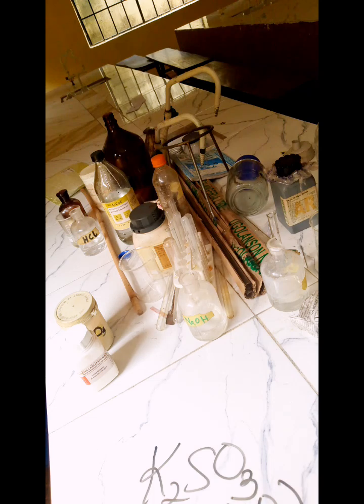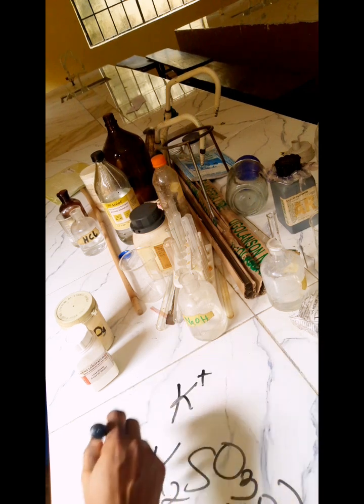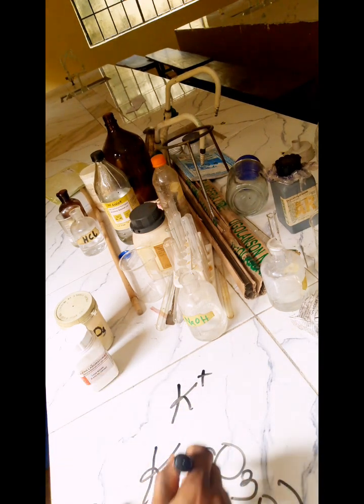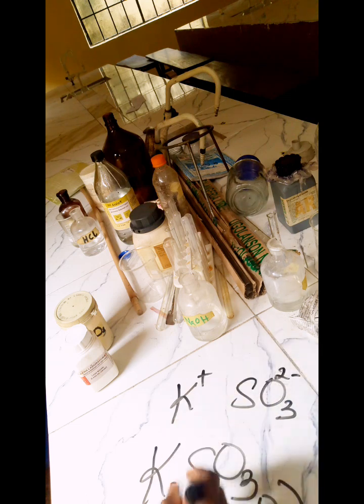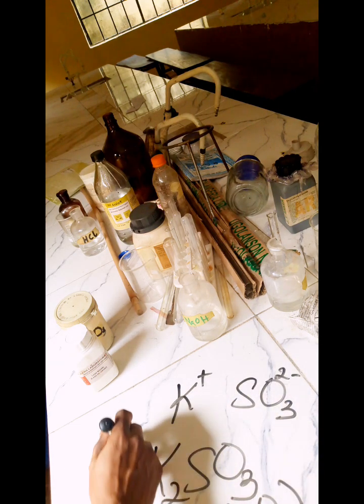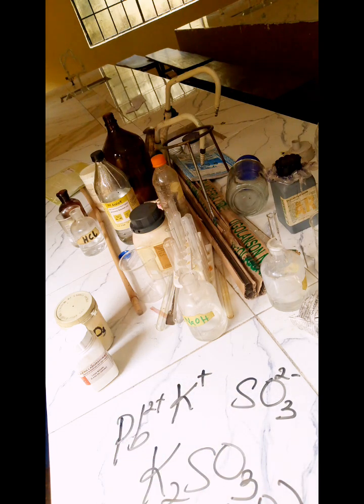The students will be required to identify the potassium ion, the sulfite ion, that's the trioxosulfate(IV) ion, then the lead ion, as well as the nitrate ion, the trioxonitrate(V) ion.